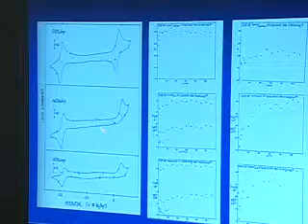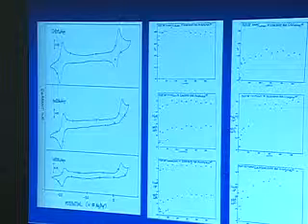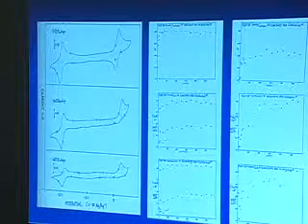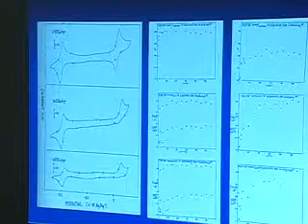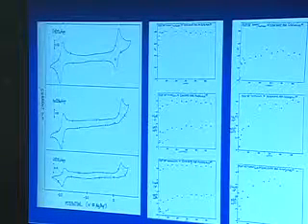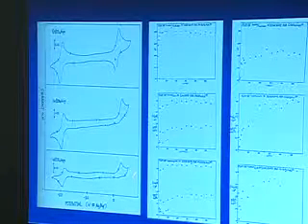Now let's talk about this a little bit. This would be an oxidation. In all cases, it's moving around. It's different. That is metal-centered. So we have metals there that are in the zero oxidation state. The complex is neutral, and we're pulling an electron out. It's a d-electron on the metal that's coming out. And in the case of the chromium system, it's a fairly reversible process. But in these other cases, that's clearly not the case.